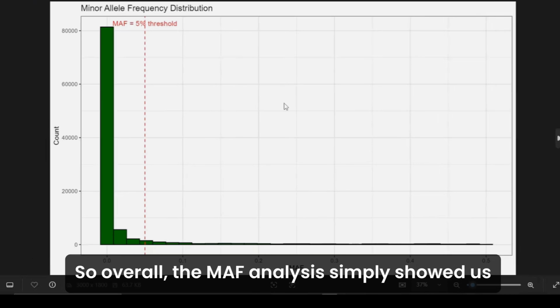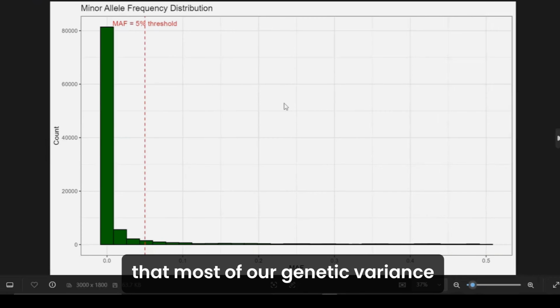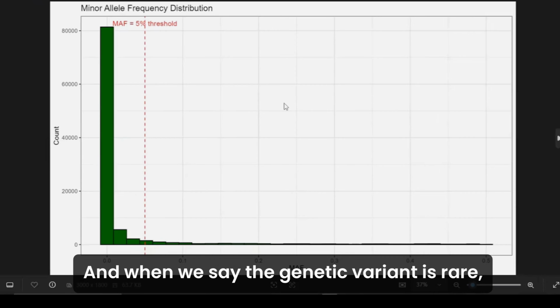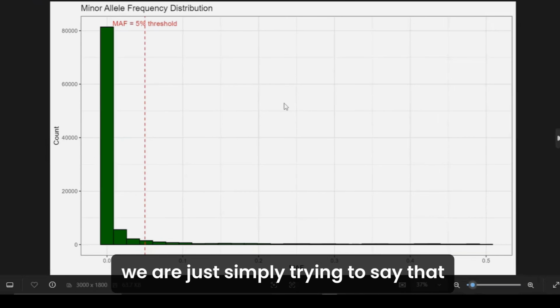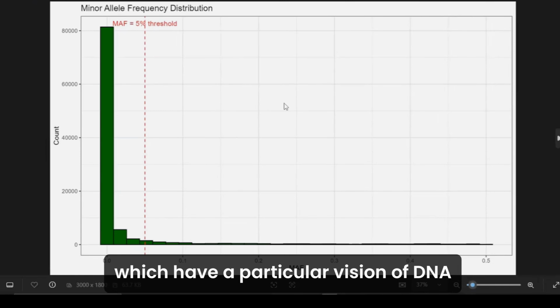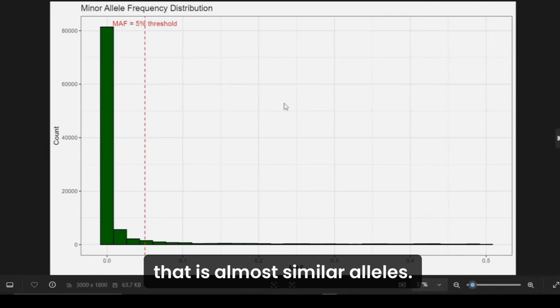Overall, the MAF analysis simply showed us that most of the genetic variants in our original dataset were very rare. And when we say a genetic variant is rare, we are simply saying that very few people in the whole dataset have a particular version of DNA with that allele.